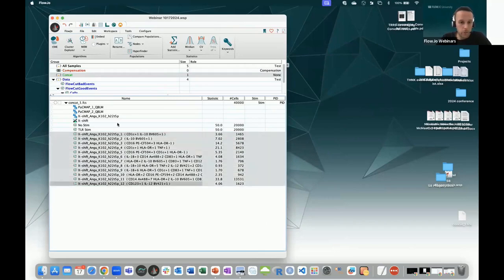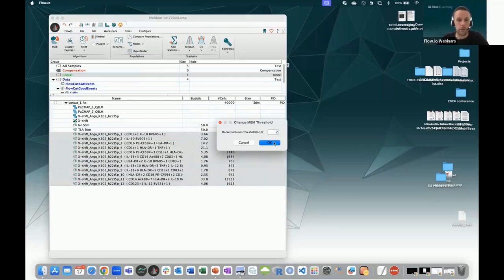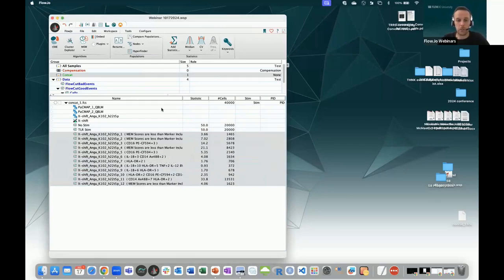All right, so we have all the naming. Maybe this naming is long, with a lot of parameters, so I'll show you that you can put a threshold. We can put a threshold of 2, for example, to see this list shrink. In our cluster number 6, we see that it is CD14 positive, vector of 2, and IL1 beta, vector of 3. So we saw that it was an activated monocyte. When we look at cluster 11, it's only CD14 positive, DR positive, so just my regular, non-activated monocyte.